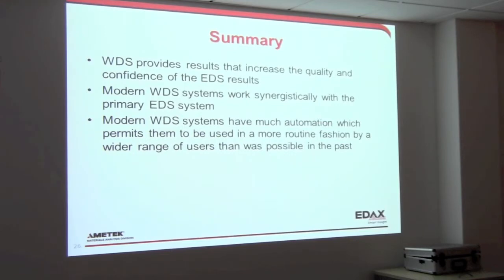So let me just see if there were a few other things based on what I heard earlier. I just want to drop back to make some comments on some other things. The auto Z routine was a question someone alluded to. When do you have to change the Z focus on the stage? You have to change the Z focus whenever you change the sample, or if you move large distances on a sample, in case the sample is slightly tilted. If you're only moving a half a millimeter or a millimeter, you don't really have to adjust the Z, but if you're moving a far distance, you have to do it.